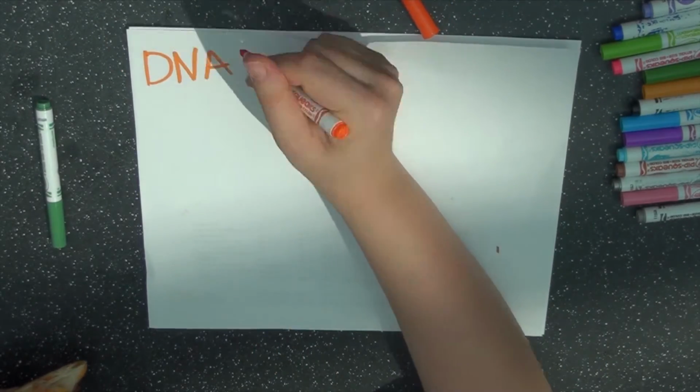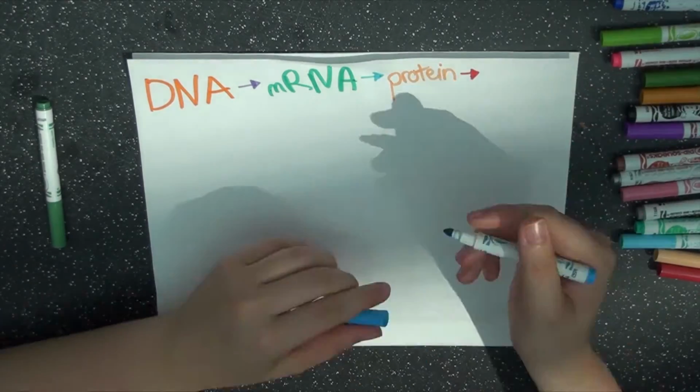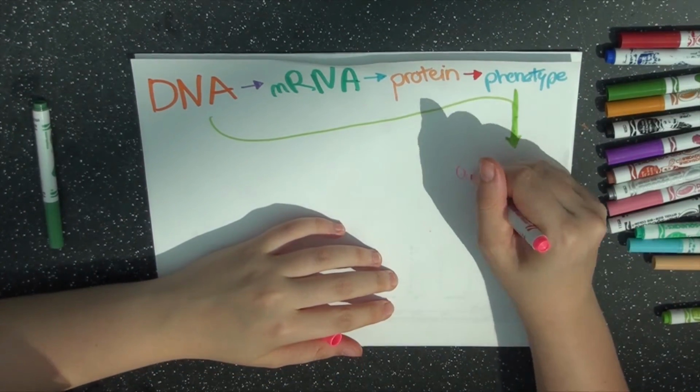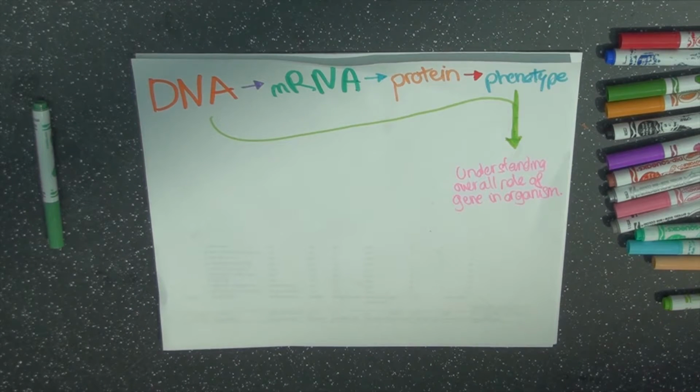Breeding transgenic animals allows for the process of reverse genetics, the discovery of the function of a gene by analysis of the phenotypic or observable effects of the specific engineered gene sequence. Let's see how to make transgenic knockout animals, or animals that do not express a particular gene.